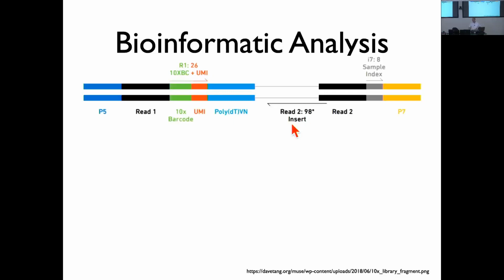Yep. So if you're doing reads from both directions here, what's the technology doing the sequencing? Because it's a bead, so it's not next-gen sequencing? No, it's next-gen sequencing. By the time you get here, as far as the sequencer is concerned, it's just like any other sequencing library.